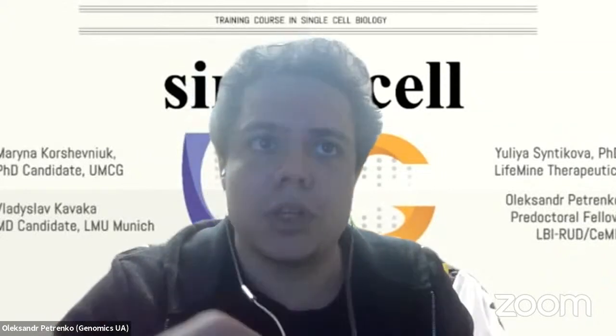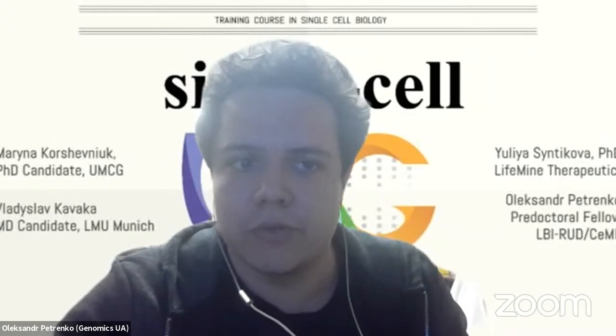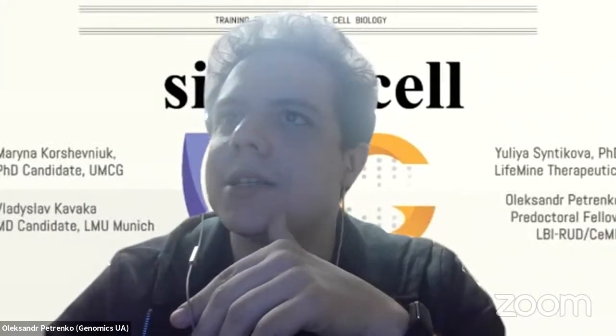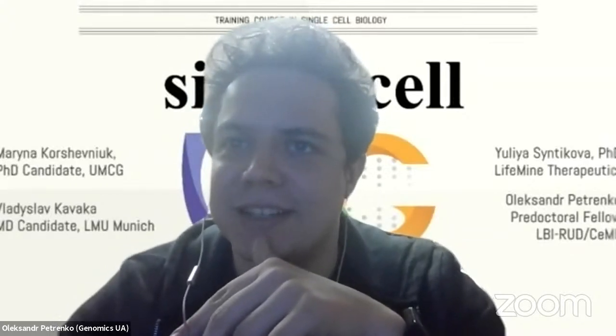The last question: what type of data can you use for Azimuth? I guess it's regarding the input data, but I have no experience with Azimuth, unfortunately. I do not remember that issue by heart, I just remember that it existed. It was some manual procedure from my side, for sure a Seurat object, no doubts, but I'm not sure if other data types work. So the short answer is it's better to check the Azimuth manual. Personally, I didn't work with it. I am a simple person working with Seurat in my environment for a few months, updated every month. So that's the short answer.